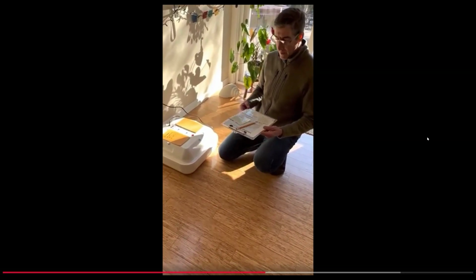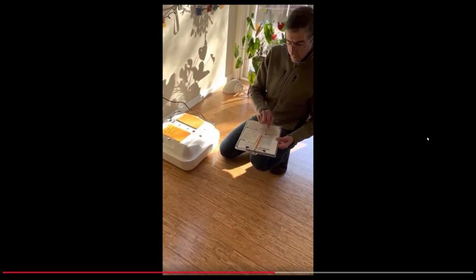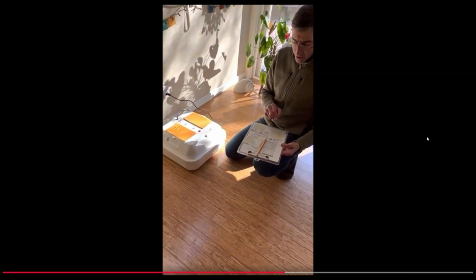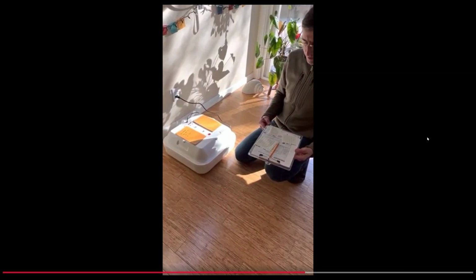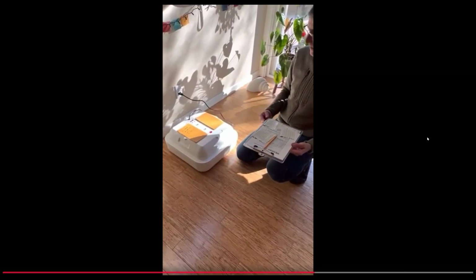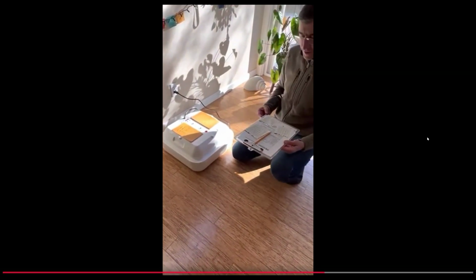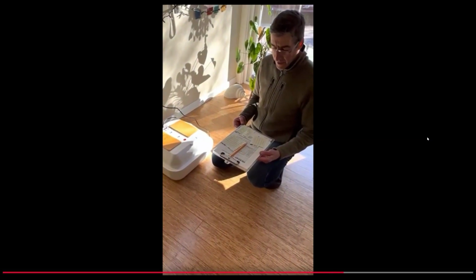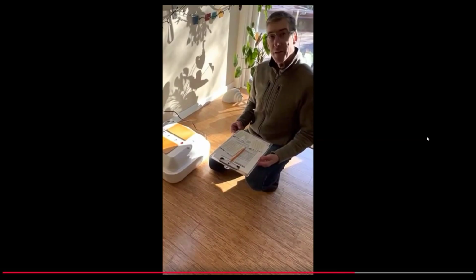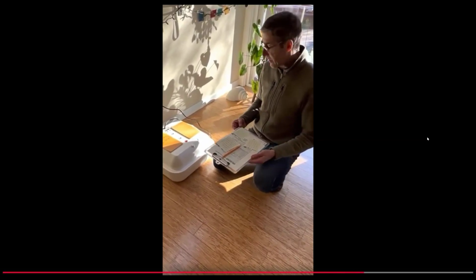So I'm going to note on my data sheet my sample size, my incubation time, which I'm going to start right now, and my incubation temperature. This one is 35.5 degrees Celsius, and then my incubation period when it's done. In this case, it says media expiration date, so we would just use the expiration date of our R cards.